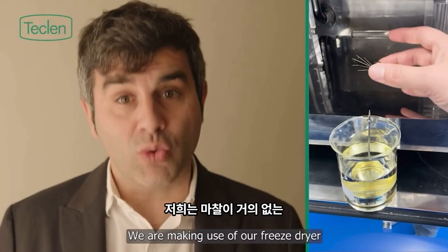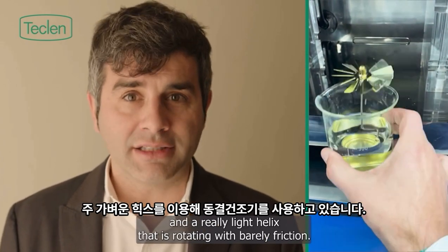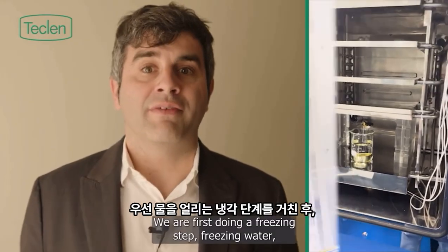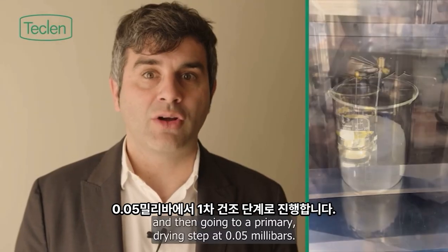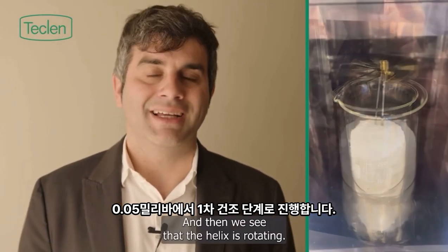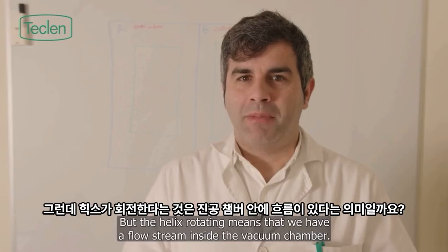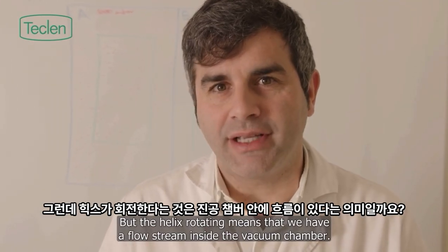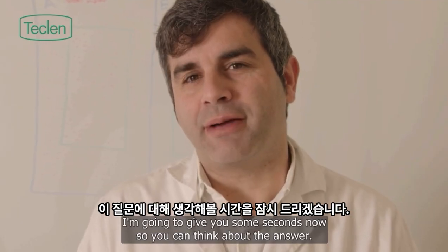We are making use of our freeze dryer and a really light helix that is rotating with barely any friction. We are first doing a freezing step, freezing water, and then going to a primary drying step at 0.05 millibar. And then we see that the helix is rotating. But the helix rotating means that we have a flow stream inside the vacuum chamber. I'm going to give you some seconds now so you can think about the answer.